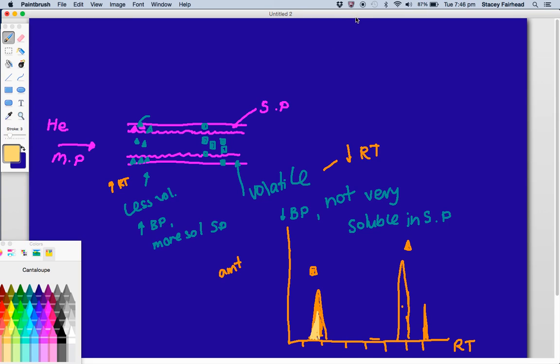It's also possible to plot a concentration calibration curve using gas chromatography analysis. So similar to your atomic absorption stuff, if you plotted a calibration curve and then you, let's say, run a blood sample for a blood alcohol reading, for example, you can then use your known standards to come up with a reading for concentration.